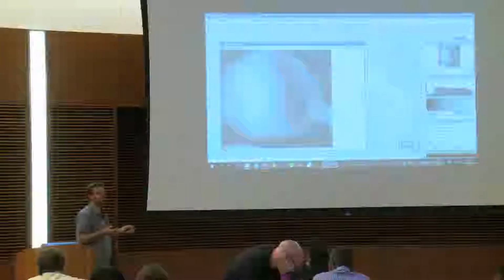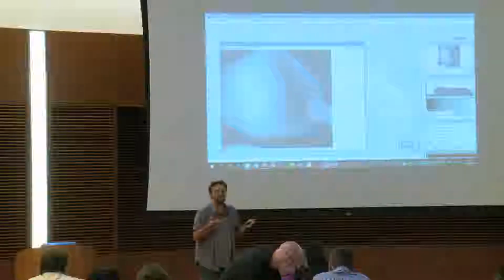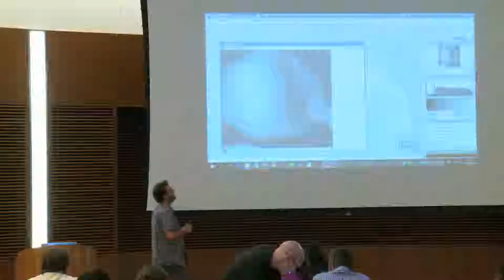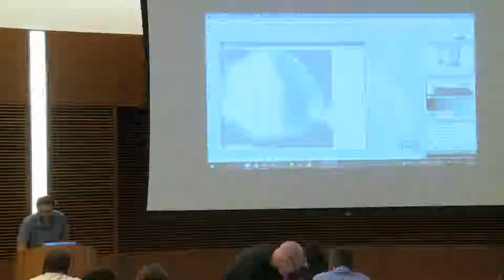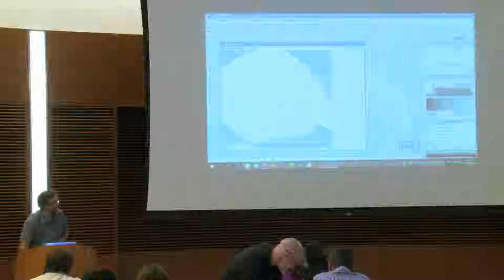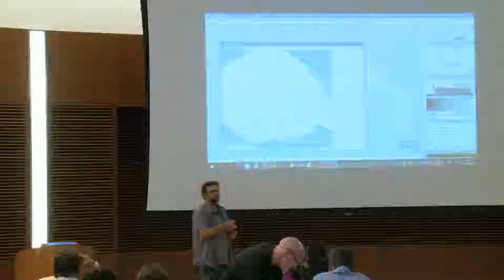So what you can say about this area is that the background should be the maximum number of pixels that are about the same intensity. So if I want to see only the background, I take the boundary that is here, this red one, and I go to the maximum that is here, okay? So I switch to this red thing, and then I take the blue, I switch to here, and now I have a look at my background that is here.